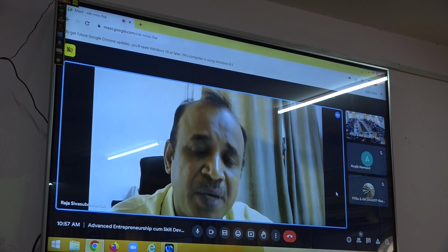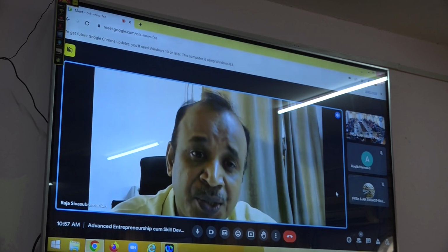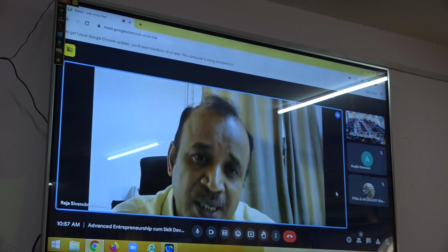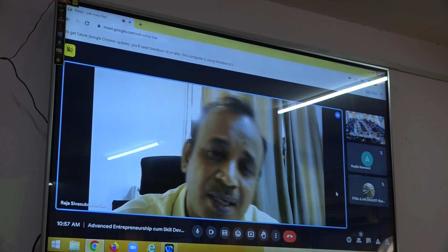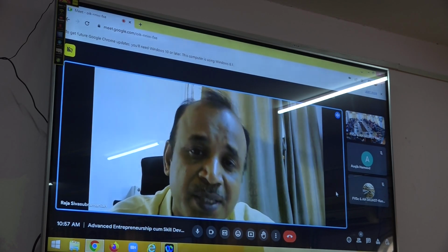So how much they have added, the other portions apart from Pashmina, for that you have to use the Soxhlet apparatus and you can exactly find out how much chemical is added on the fabric. That we normally call the add-on percentage.